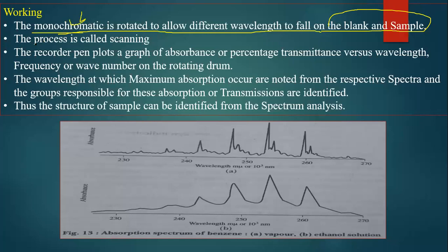Now, whatever recording is going on, that is called scanning. That is called scanning, and that is with the help of your monochromator.